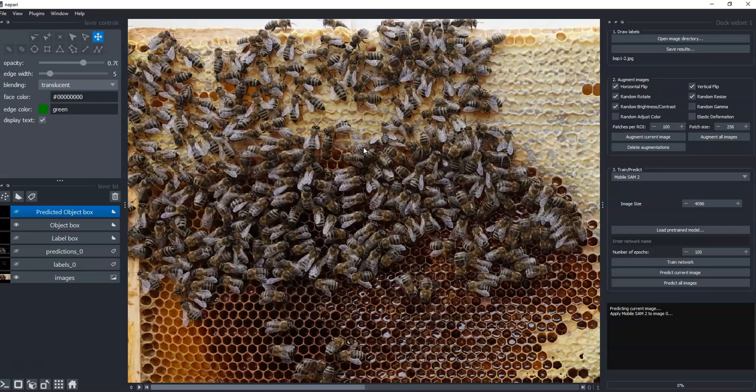But what do we do with all this information that it returns? I think that's an ongoing question. Some people have been discussing it on the forum. If you have any insights to how to process entire complicated images with SAM or YOLO, I'd love to hear them. But yeah, that was SAM and YOLO on the bees.